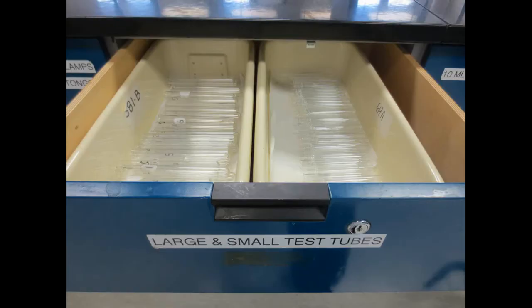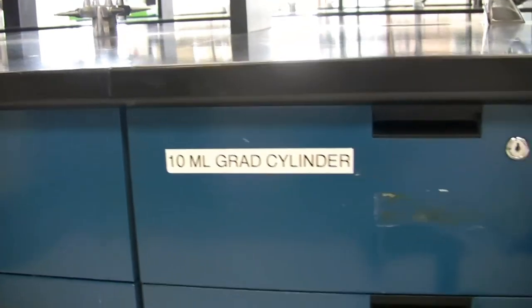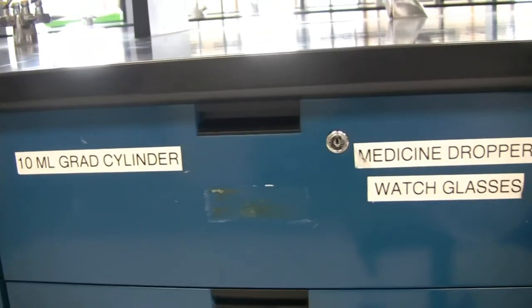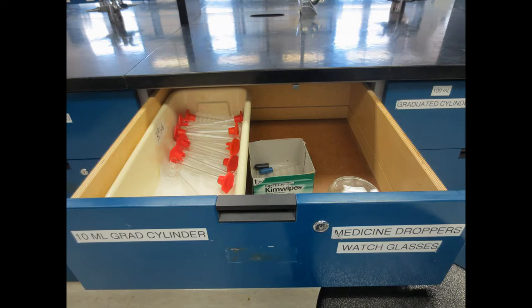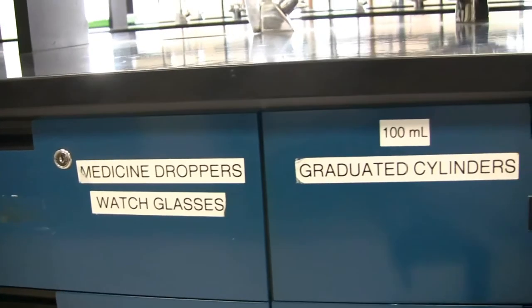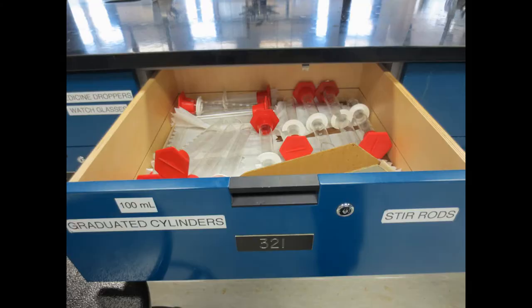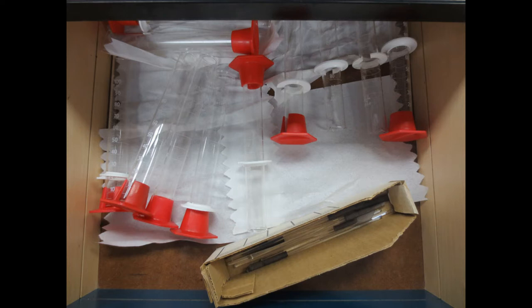Next is large and small test tubes. 10ml graduated cylinders, medicine droppers, and watch glasses. 100ml graduated cylinders and stir rods, or rubber policemen.